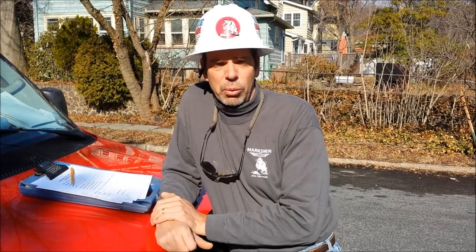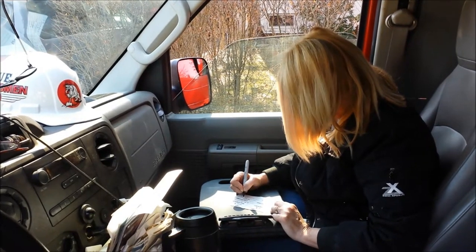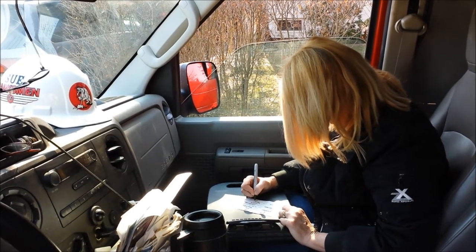Because today, this video is all about groundwater sample collection and proper procedure for that. Come on along with us, we'll show you how we do it. And here's Sue filling out the chain of custody and all the labels for the bottles that we're going to be using to collect the groundwater samples today.